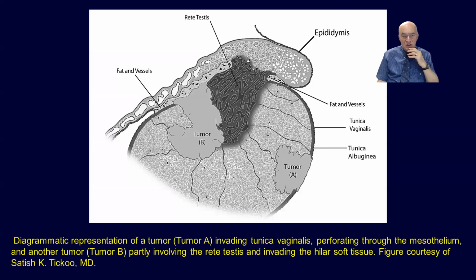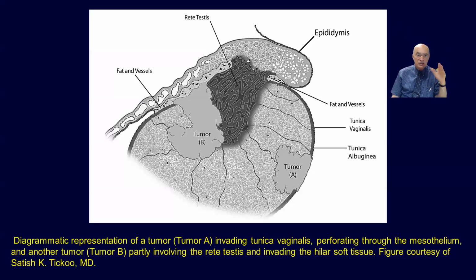Then going to testicles, remember always that we need to make these nice sections of the specimen to be able to expose the epididymis, the rete testis, and also the presence of the tumor in relationship with the testicular parenchyma, and see if there is exposure of the tumor into the tunica albuginea or the tunica vaginalis.